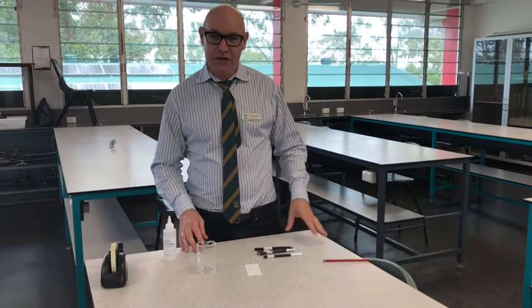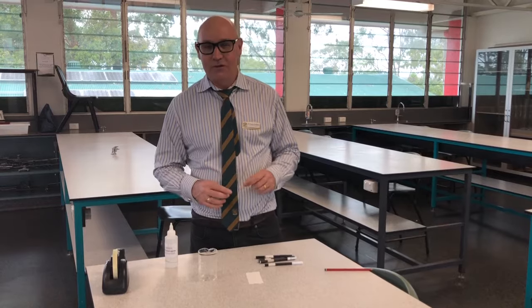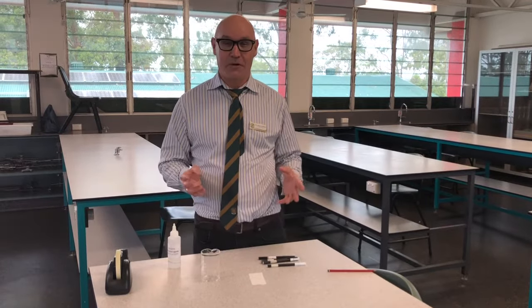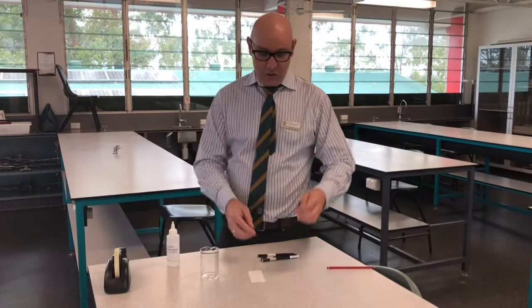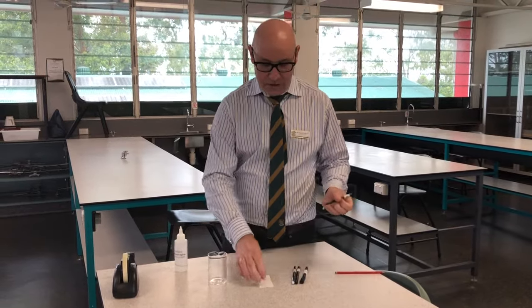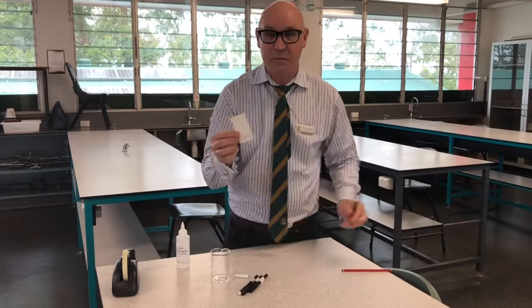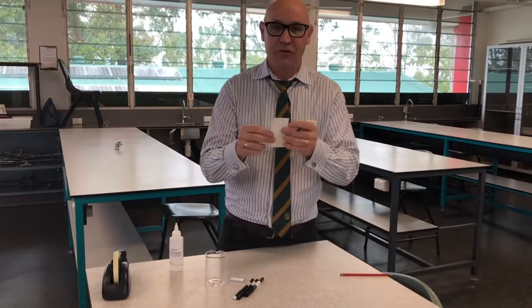Hey everybody, I just want to show you a simple forensic technique called ink chromatography. We've got different pens and we're going to put a dot on this filter paper - you can actually just use paper towel as well, something that's going to absorb the liquid.